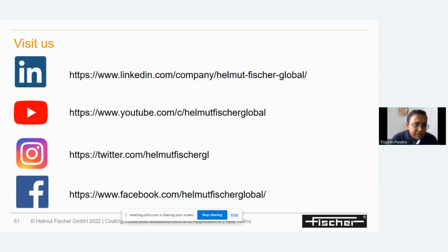Second question: share the design number by which we can check coating hardness. The coating hardness can be checked with nanoindentation-type instruments. We have different types depending on your coating.